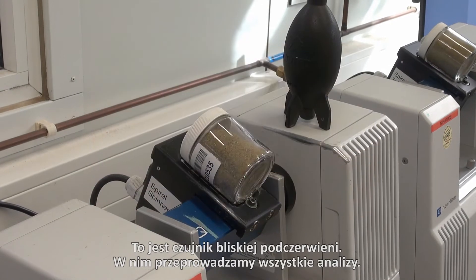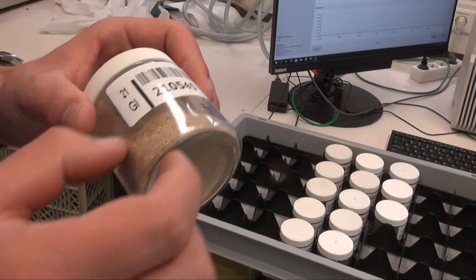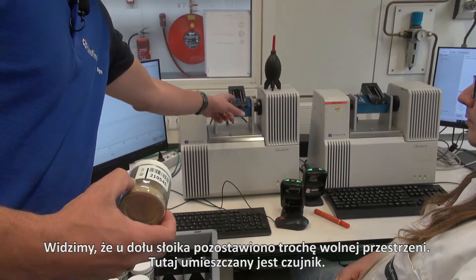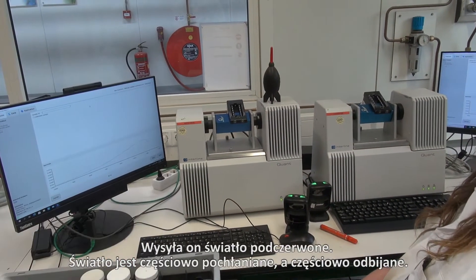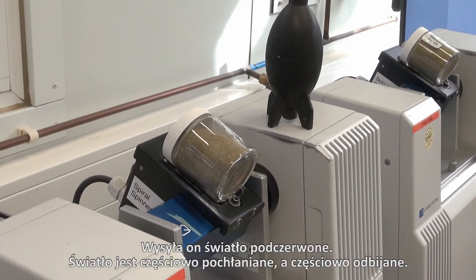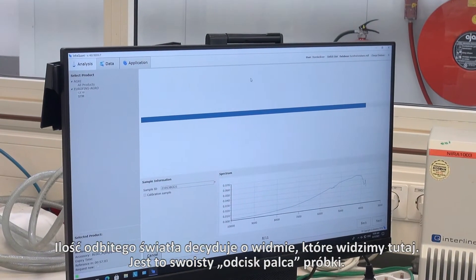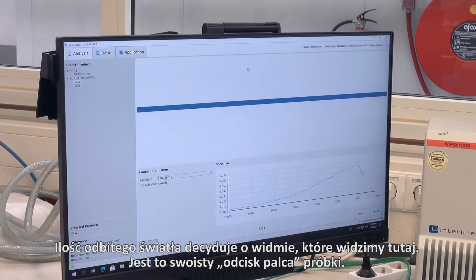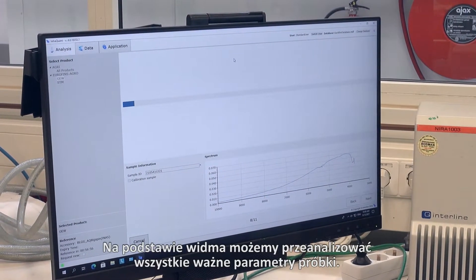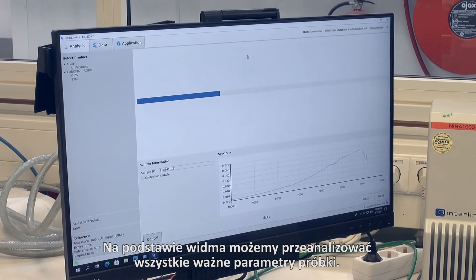This is our near infrared sensor. This is where we do all the analysis. As you can see, there is a little bit of space left at the bottom of the jar which goes on the center over here, and that sends out an infrared light. That light is being partly absorbed and partly sent back. The amount absorbed gives you a spectrum, as we can see here. And that is the fingerprint of the sample. By measuring that spectrum we can analyze all the important parameters on the report.